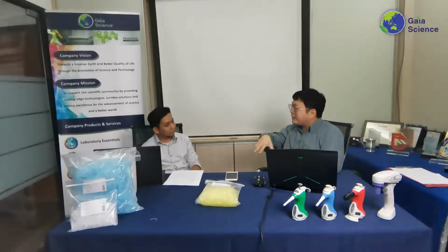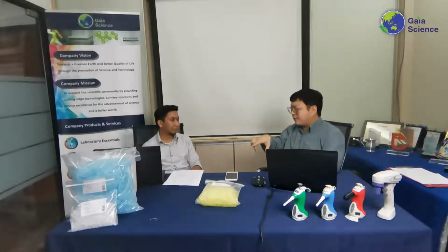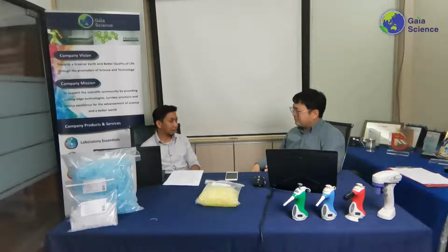But you could rack it and use it as normal as well, and it's the same purpose. Like I said, it could be for those that are doing chemicals that don't need to be sterile, or first-time users. I don't see it so often. Not sure whether you've seen it often as well? No, very rare, but I know that type exists. Filtered bulk pack. Yes, that's right.